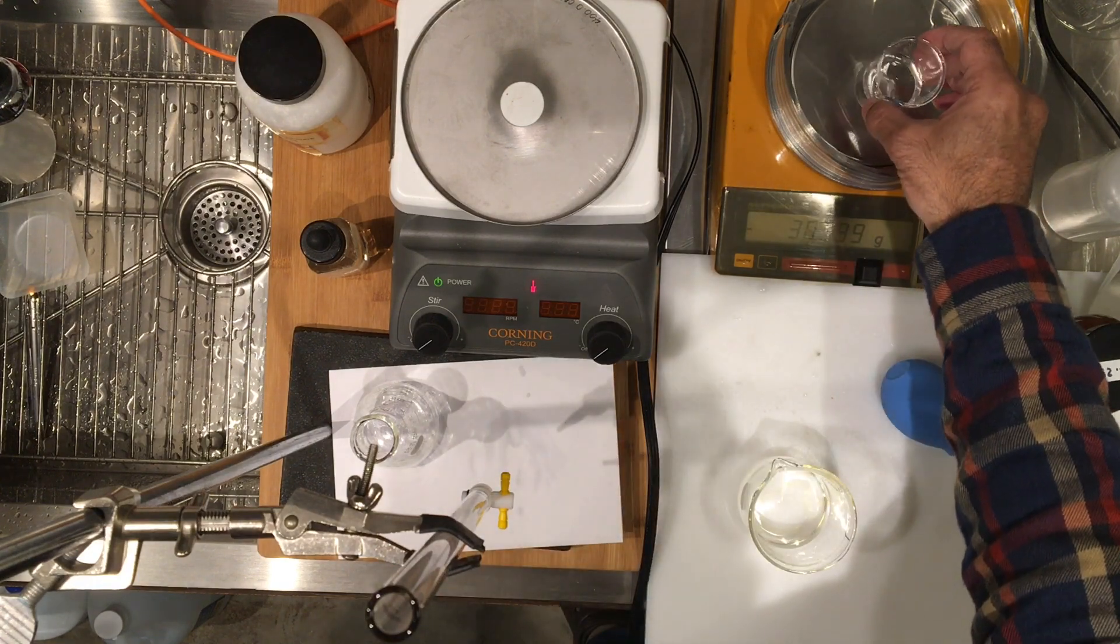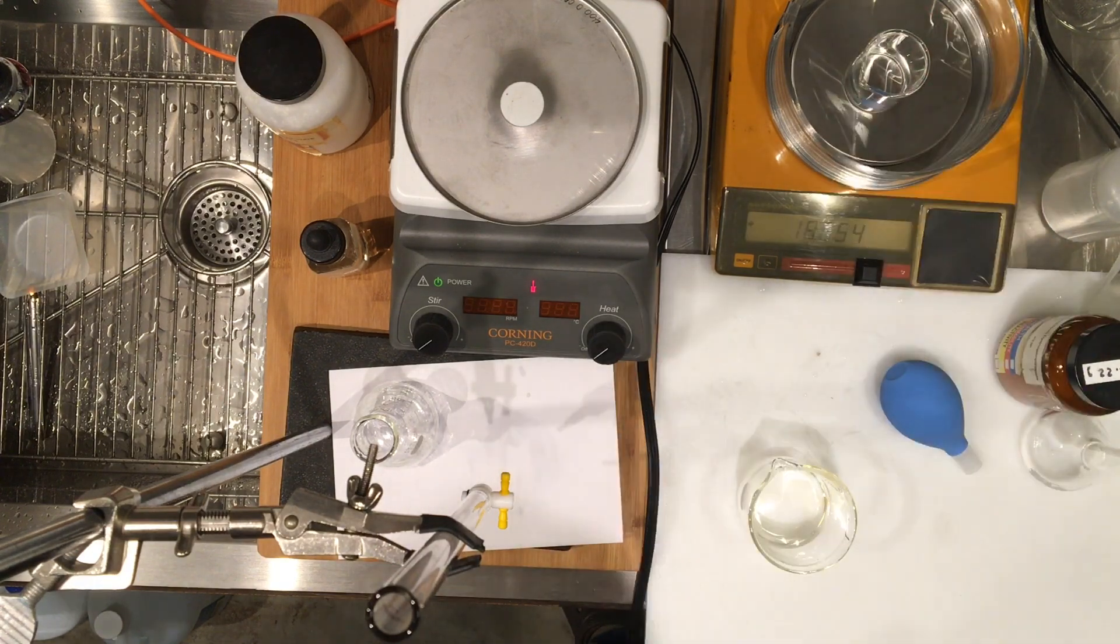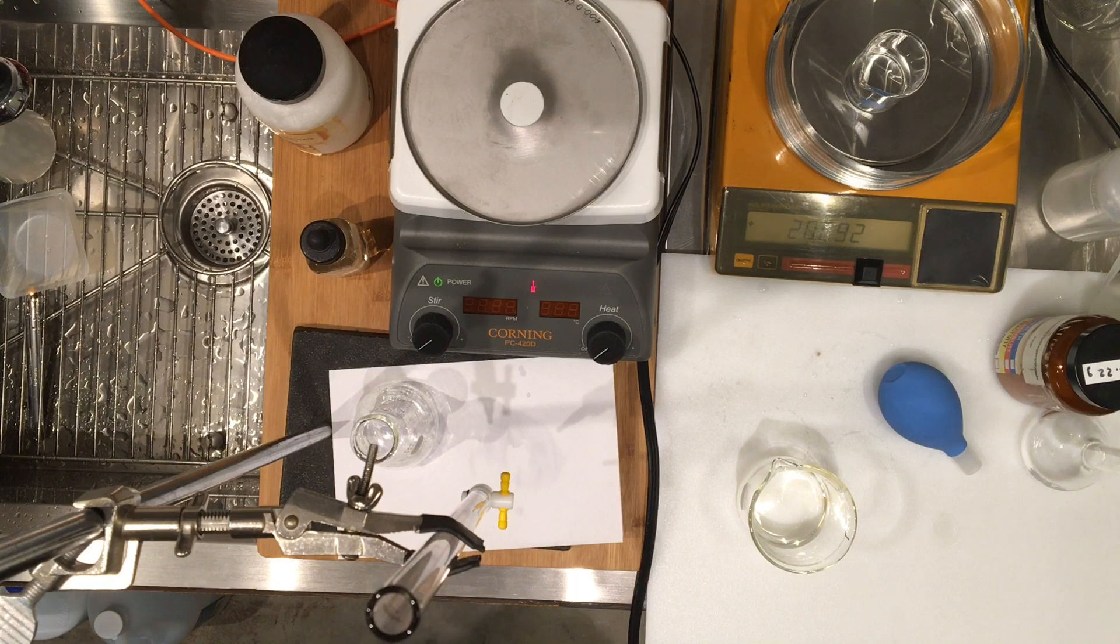Okay, so record this mass. This is the mass of 20 milliliter, it's 20.092 grams.